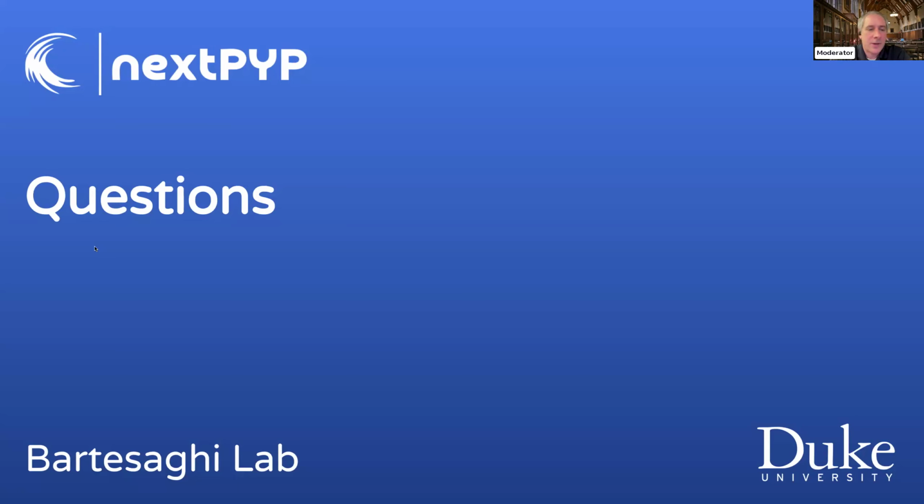Right. So right now there are ways that this can be done, but it's not easily accessible from the graphical user interface. We are thinking about trying to make that easier because we recognize that some users may be picking the particles elsewhere, and they may want to bring them back into nextPYP. So right now, I guess the easiest way is, if you have a .mod model with your particles, that you should be able to do, provided that you place them in the right directories within your project. But as far as Dynamo specifically, there will need to be some translation between the format that they use and the format that PYP uses. But if you can convert those XYZ coordinates to a .mod model, then you should be able to import those into nextPYP.